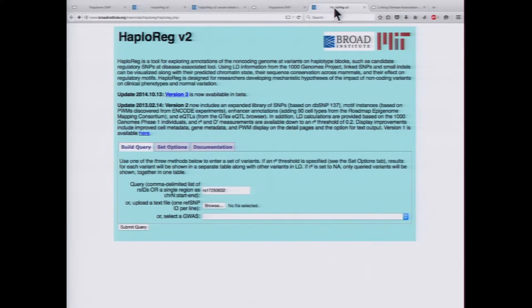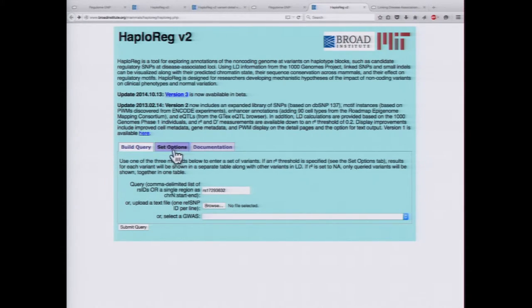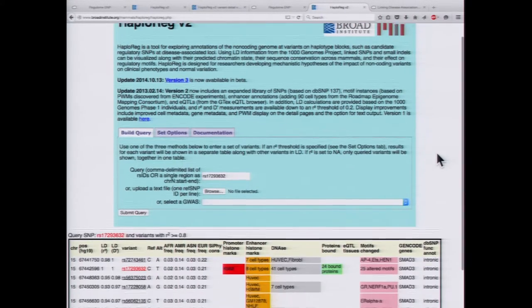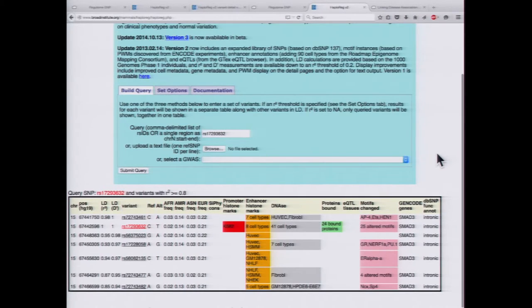We are pretty sure that something is going on at this locus, but it's also possible there are other SNPs in LD with our lead SNP that could be contributing as well. We want to look at other SNPs in LD, so we use HaploReg. Since this particular study was done in European populations, we keep that setting and submit our query. Now we can see all the different variants that are in LD with our queried variant, shown in red.